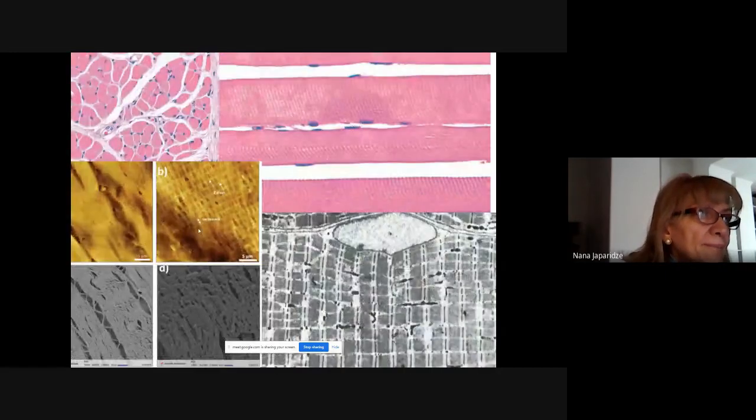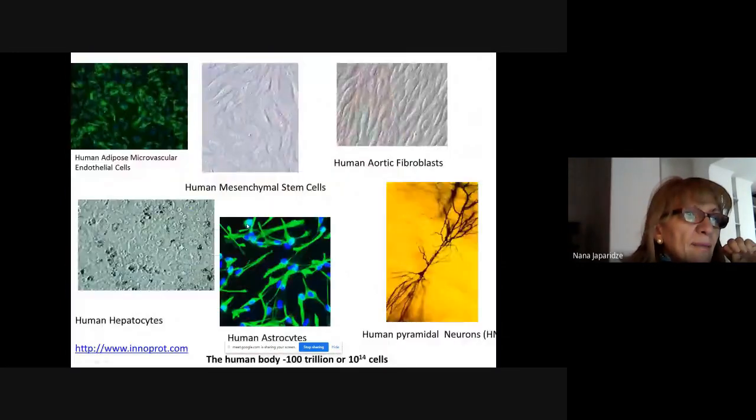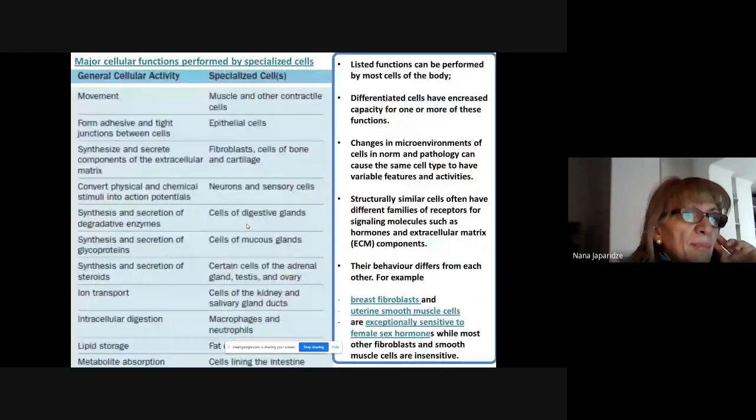But now I want to show you muscle tissue, nerve tissue, and the organelles of cells obtained.